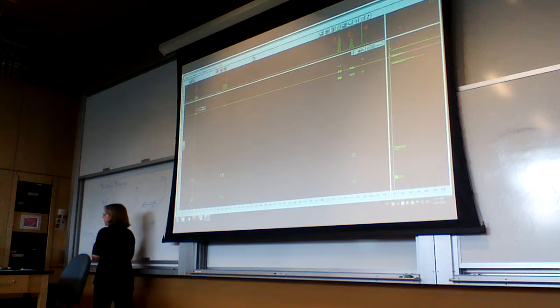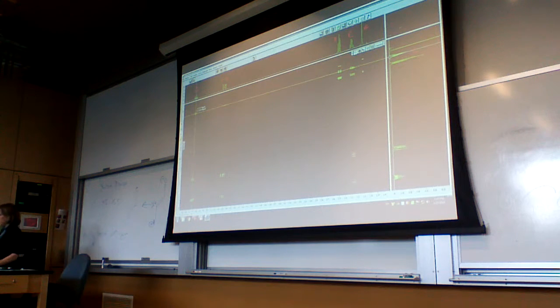We also see that C here is coupling with the F and E. So I'm going to say this peak is our CD peak. We're seeing the coupling between those two protons. We also see C and F and C and E.